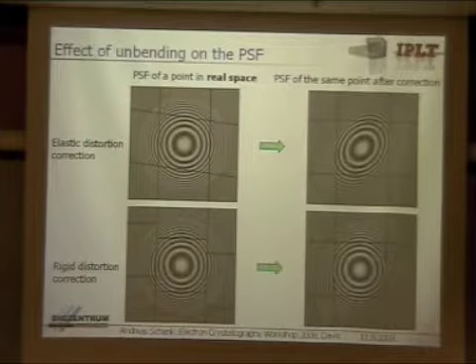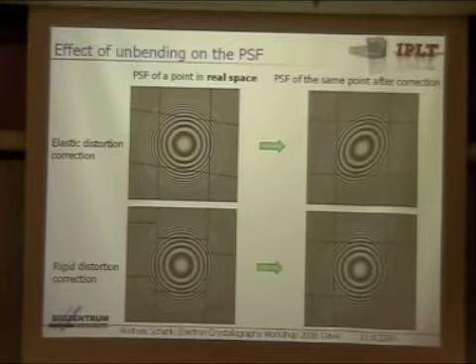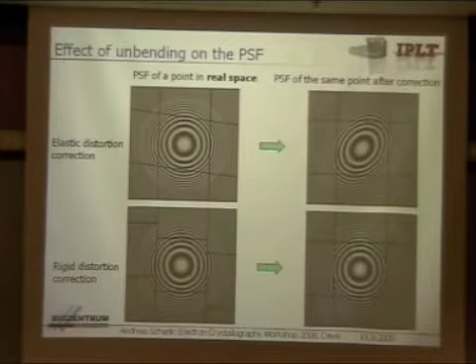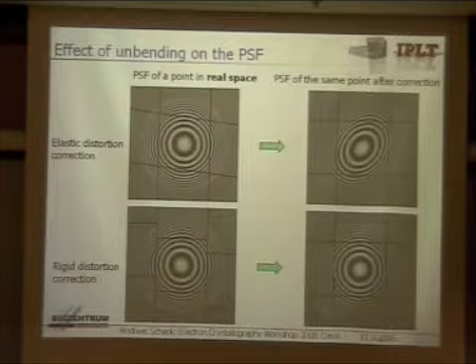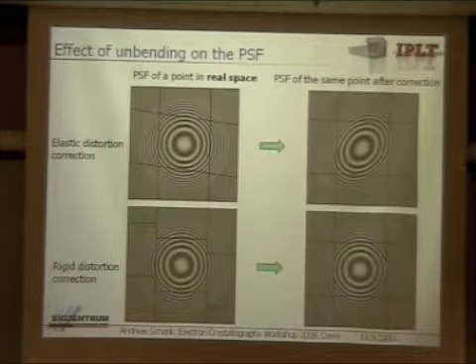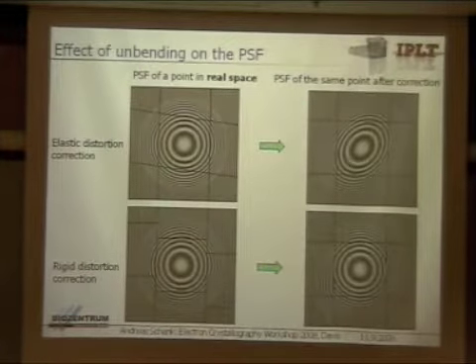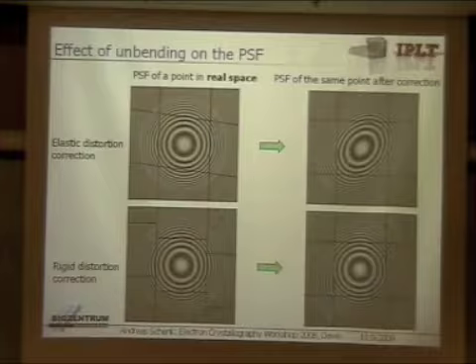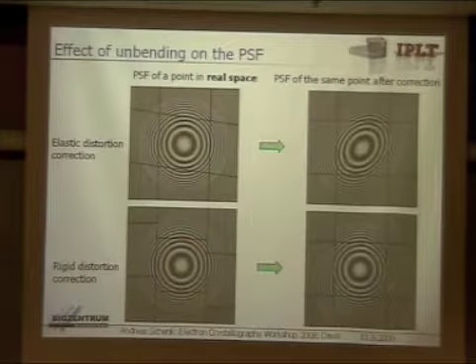But it's quite hard to judge how exactly you change the amplitudes and phases. That's why I simulated. But you for sure also change the amplitudes and phases of the diffraction peaks of your crystal. So the two columns on the right would result in a dampened envelope function of the CTF if you do it that way wrongly, right? Yes.